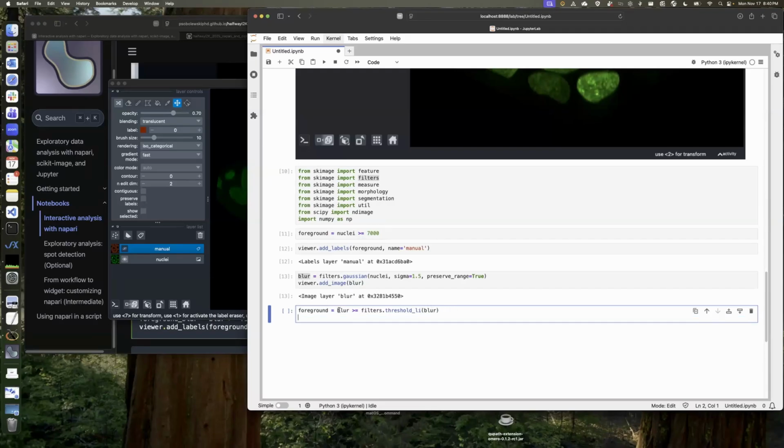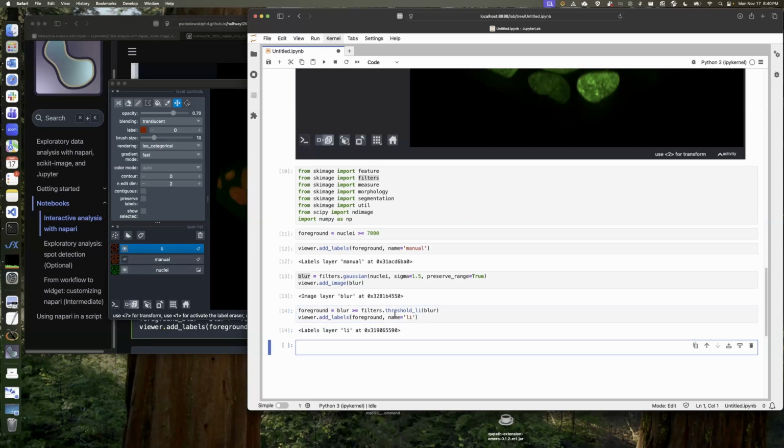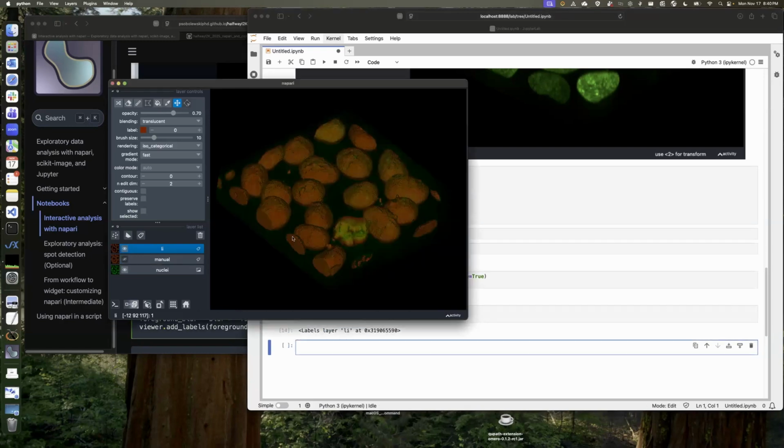So we have the threshold, and then we can add that to our viewer. And I'm going to give this a name, and this is going to be Lee. Good enough, Lee. And execute. And there we have it.